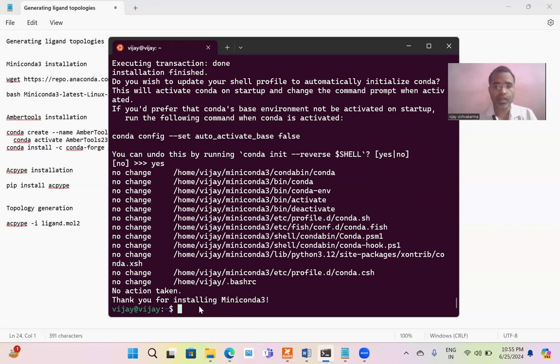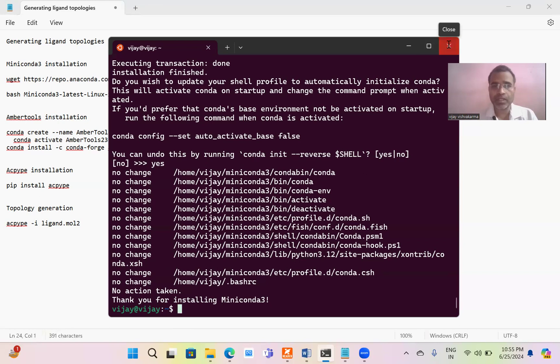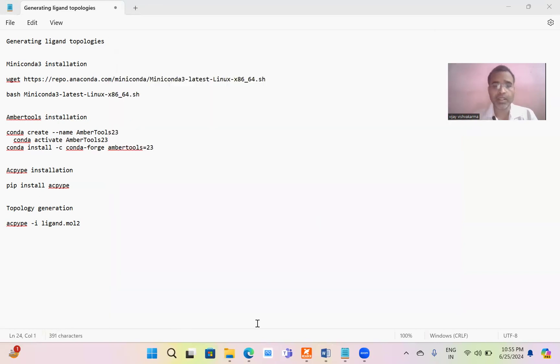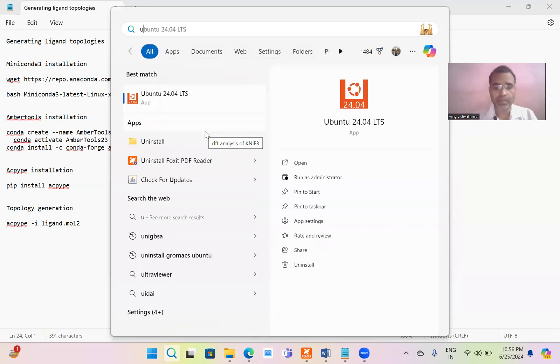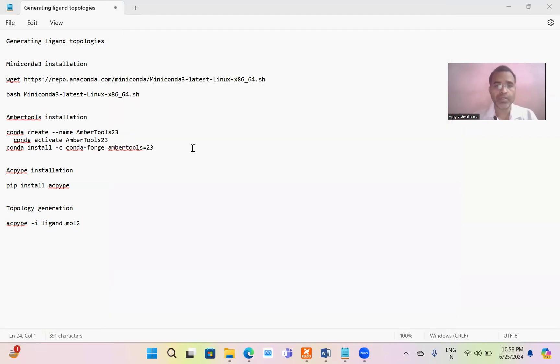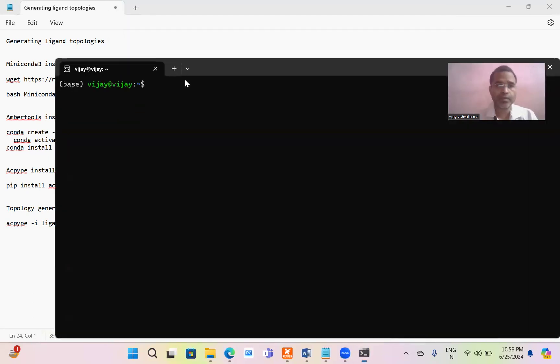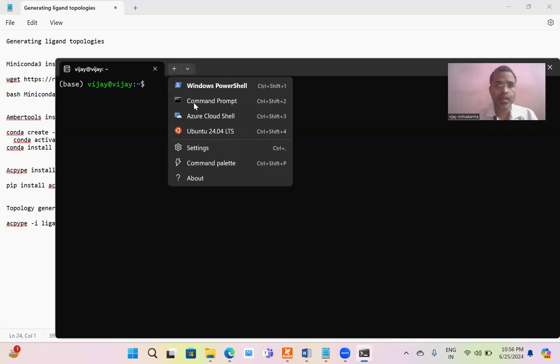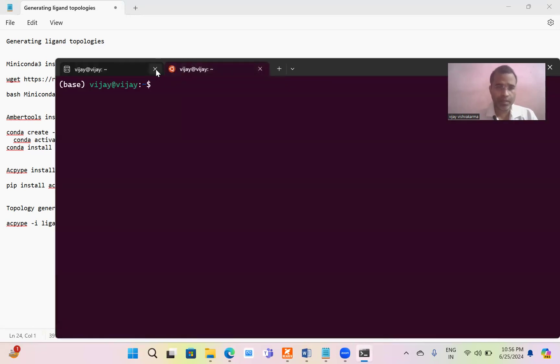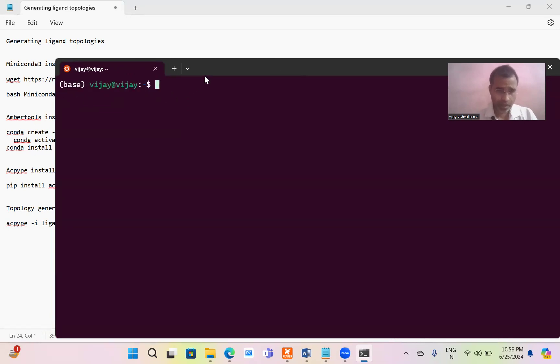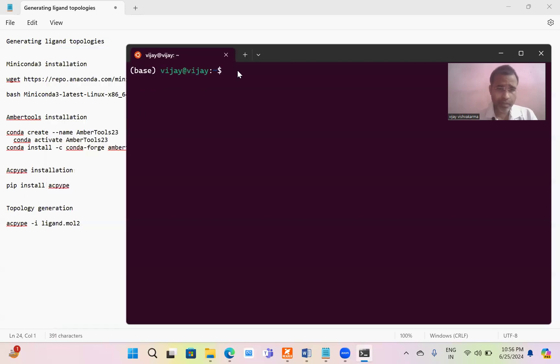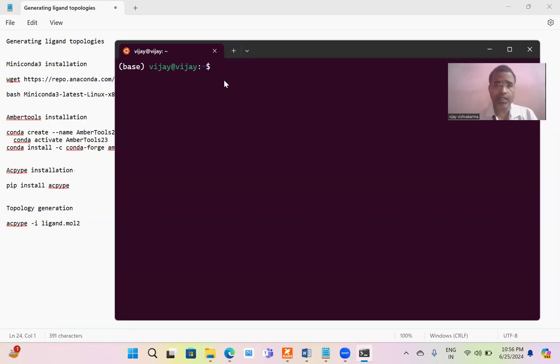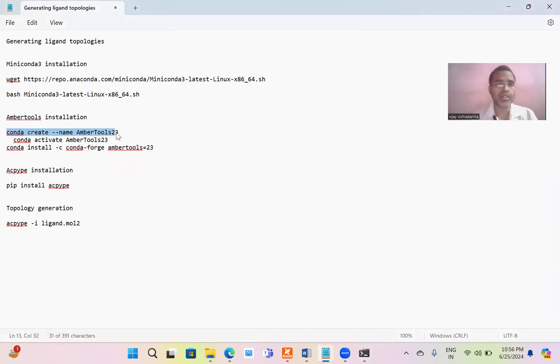It says that you have to restart the terminal to check whether Miniconda installation is successful or not. Just close it and reopen the terminal. If you get a word written as base, your Miniconda is installed. This is the clear-cut indication of the Miniconda environment. Our terminal is in Miniconda environment. Now what we have to do? We have to install the AmberTools.